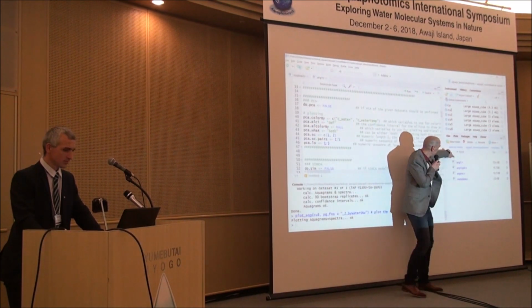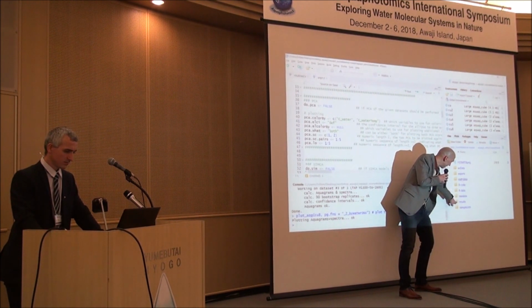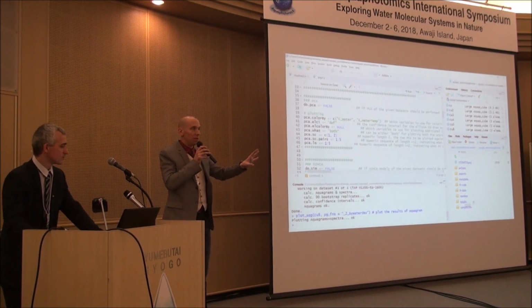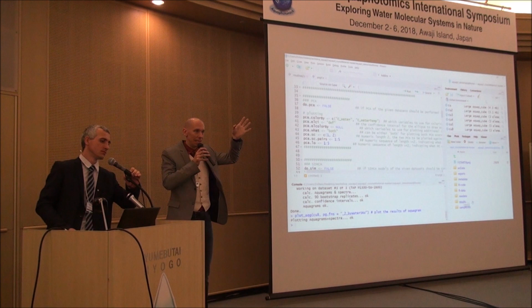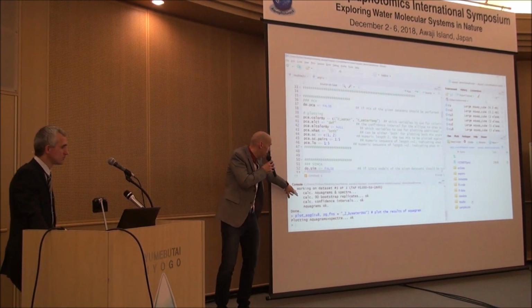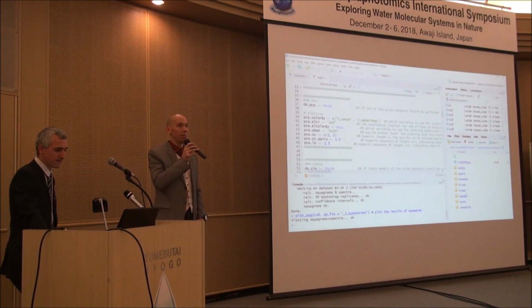If you go up again, please, Zoltan. And after that, of course, you have your data and code. We had that, your raw data, and your results come into this folder. This is what you always have to have in mind. When you analyze data, you saw two ways of dictating what to do. You have this file, the analysis script, and you can override values, what we did. So at home, if you study routine 1 and routine 2, you will find out what we meant by that.